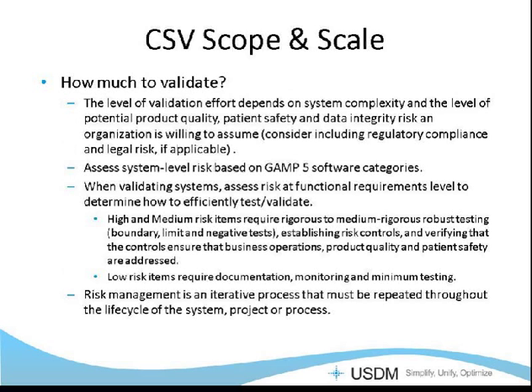How much to validate is the eternal question. The level of validation effort depends on how complex your system is and what impact that system might have on patient safety, product quality, data integrity. You have to really look at regulatory compliance and legal risk also if you're generating data to meet proprietary needs.